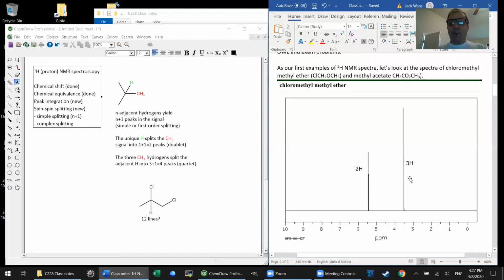It's only proportional to the number of hydrogens. It's not equal to it. All we get out of that is a ratio, that the ratio of these 2 types of hydrogens is 3:2. But simply from this spectrum, we couldn't tell if in the actual molecule it's 6:4 or 9:6, that type of thing. Right, we can't tell that just by looking at the spectrum.